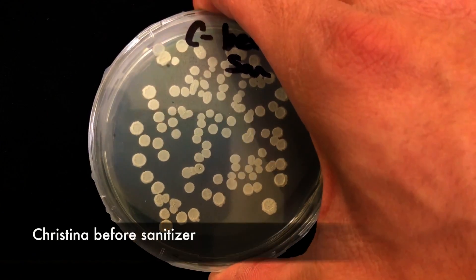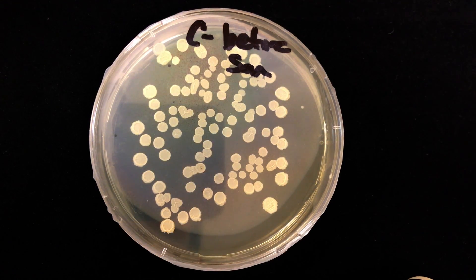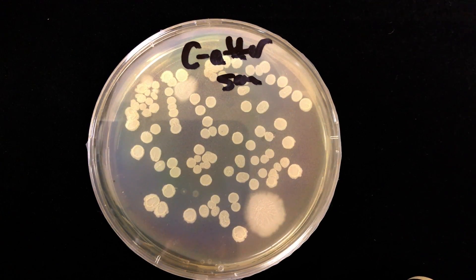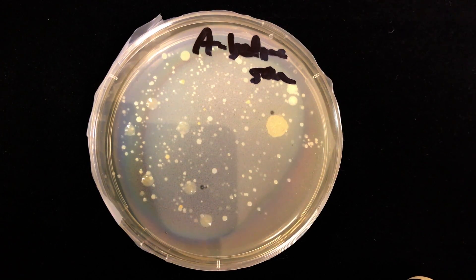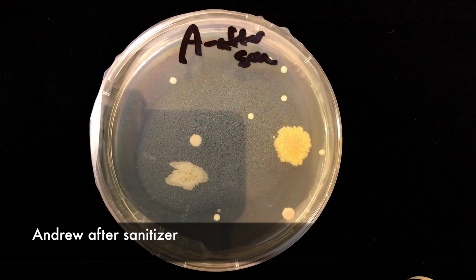Let's take a look at the results. This is Christina's sample before she used the hand sanitizer. This is Christina's sample after she used the hand sanitizer. This is Andrew's sample before he used the hand sanitizer. This is Andrew's sample after he used the hand sanitizer.